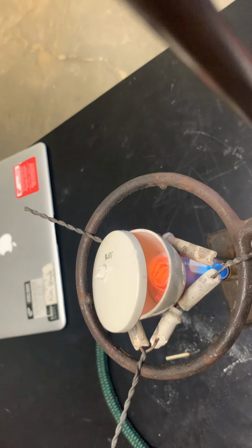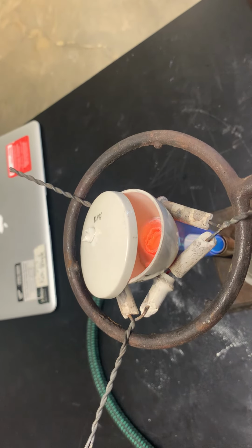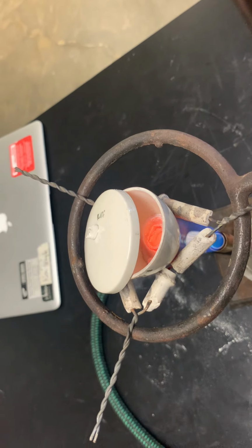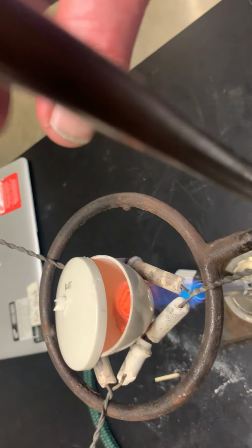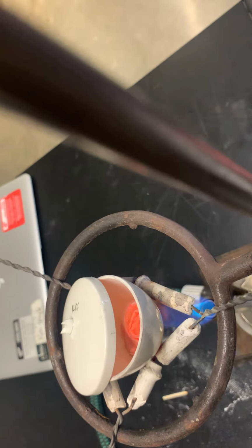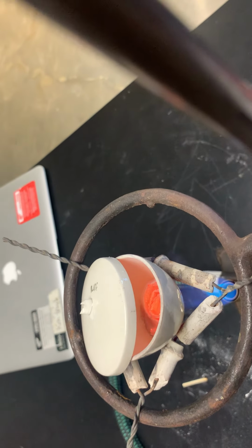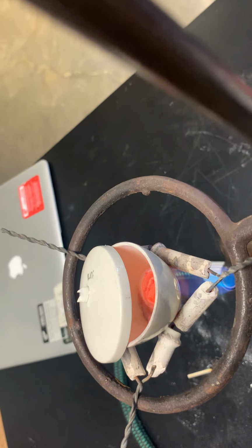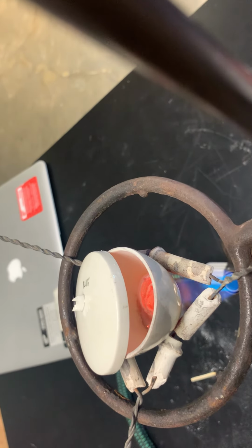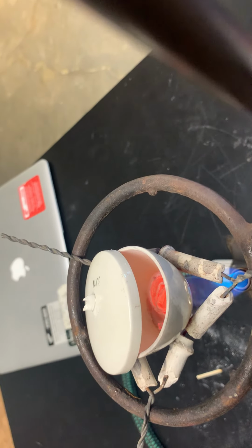Losing just a little bit of the vaporizing product. So if you go from a solid to a gas, which could be happening, and then the gas is condensing up here back to a solid, that's called sublimation. It means we got it so hot that the solid particles don't want to stick together and they end up floating away with the currents of air.